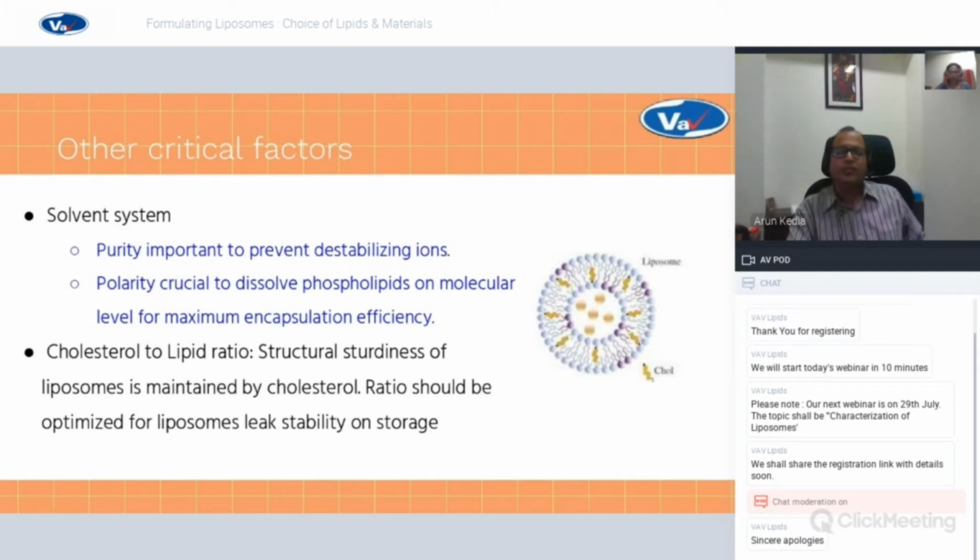So maybe less attention is paid. But while it's there for whatever short while, it has quite a role. And any impurities which the solvent will contain, even after the solvent is evaporated, the impurities will continue to remain in your formulation. So it's quite an important factor.